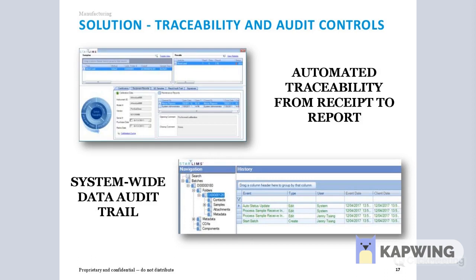And as you can hopefully make out in this screenshot, all of this information is available in the one screen in StarLims, making it quick and easy to do a review of your batch to ensure procedures were followed. The audit trail should be available for transactions in the system. The reports for the audit trail should be automated. And this screenshot illustrates the history of a folder, and you can see all of the events that occurred in the folder, such as when it was created and any of the status changes. And you can also see the user.